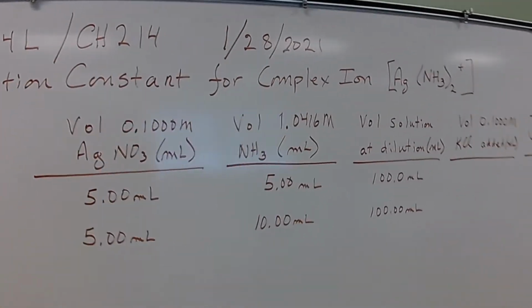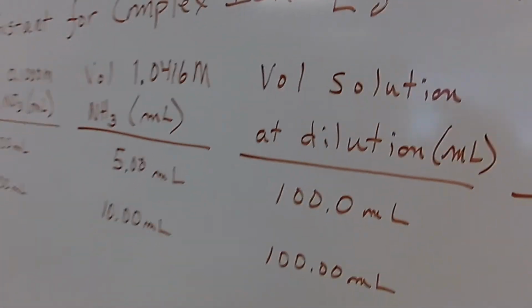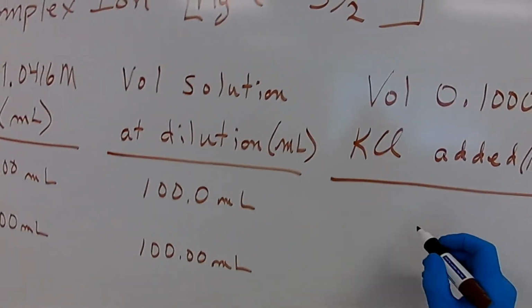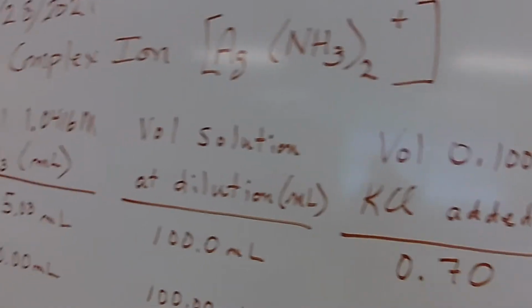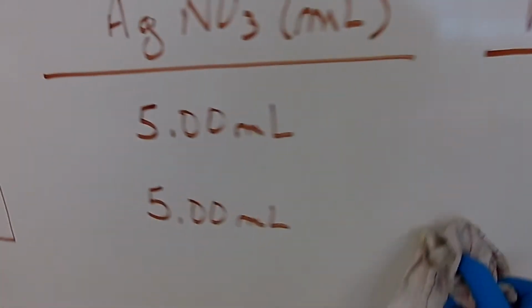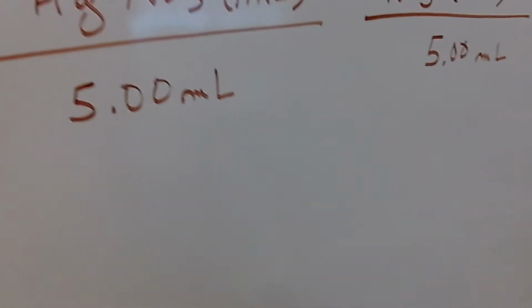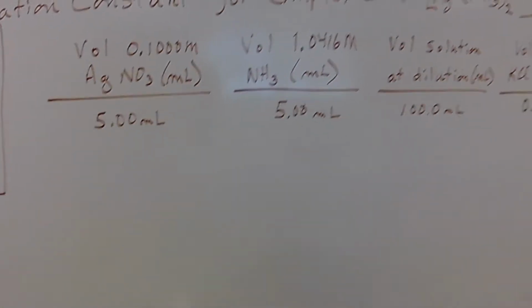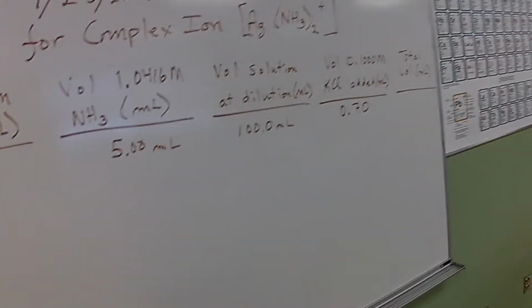And then over here, we need to put in the volume, right? So I remember what the volume was. We decided to settle on 0.70 milliliters. And we're not going to do this one. So this experiment, the way we did it, has no replicates. It's just a single determination. And of course, if you were going to do this for a research project, you would do it many times.